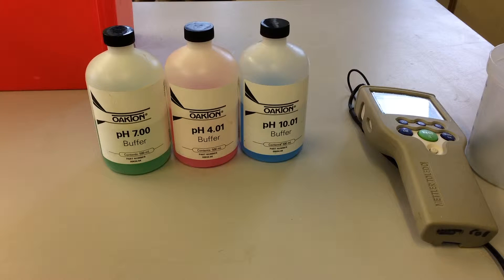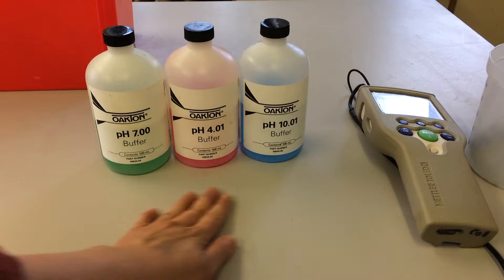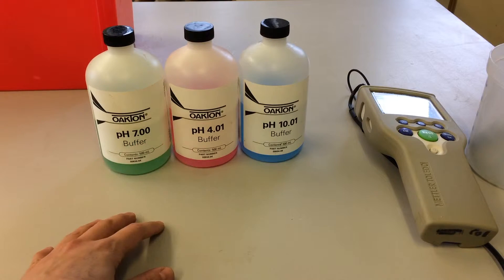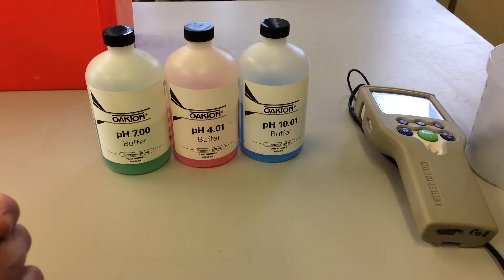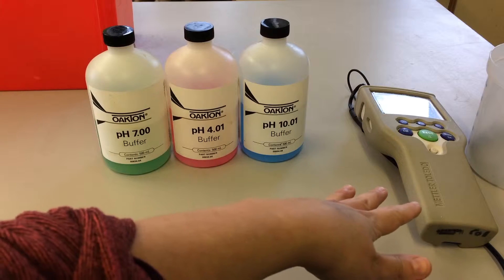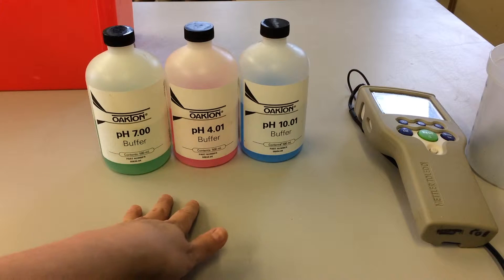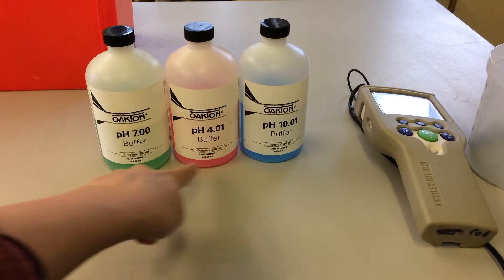With any piece of kit, one of the first things we need to do is make sure that it's calibrated before we use it. And with a pH meter we tend to use these pH buffers. The piece of kit that you use will depend entirely on the manufacturer's guidelines, but for the pH meter that we're using here, this Mettler Toledo, we do a three-point calibration, so we do it with buffers of four, seven, and ten.